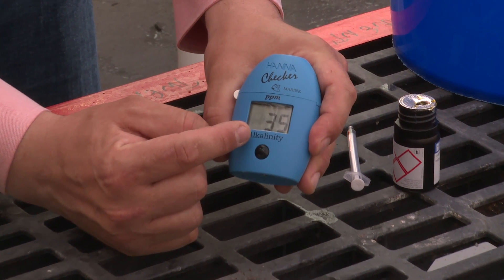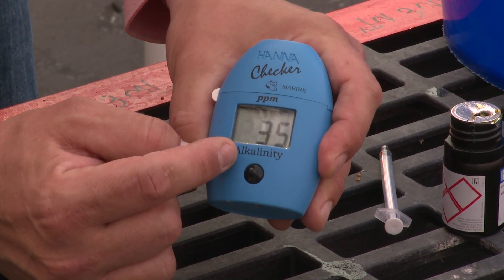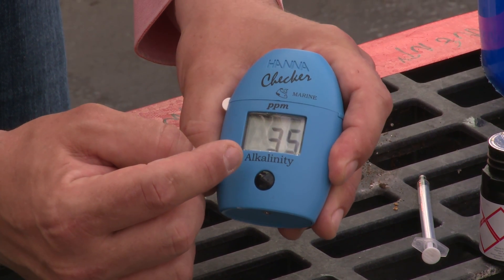You can see here it's reading 35. This is going to be a more precise measurement compared to those test strip kits, which was giving us a value somewhere between zero and 40 based on the colorimetric range.